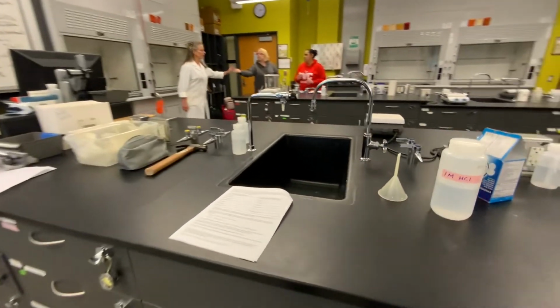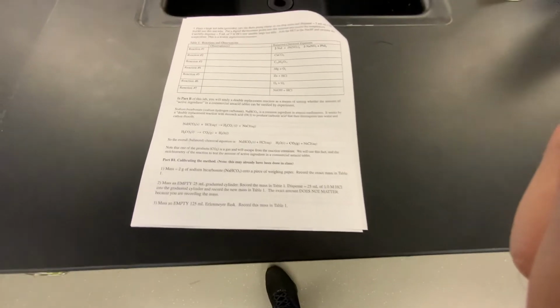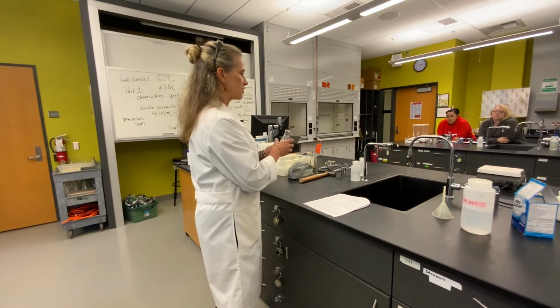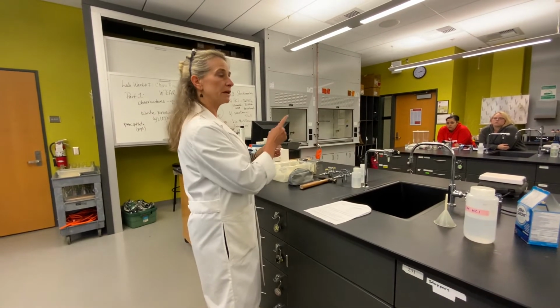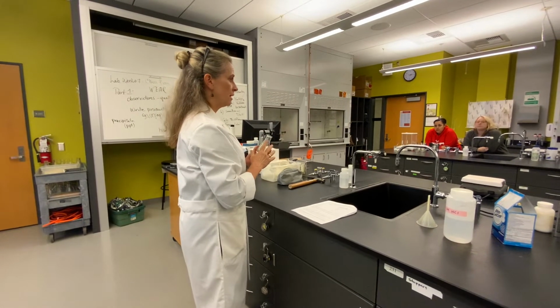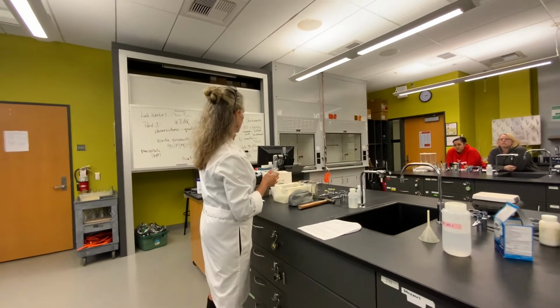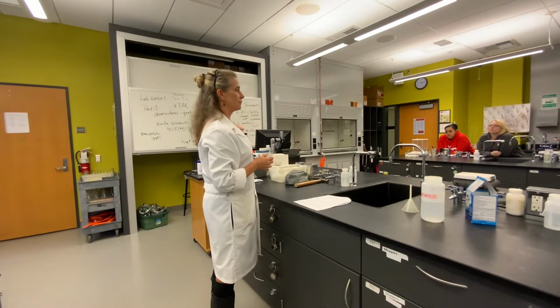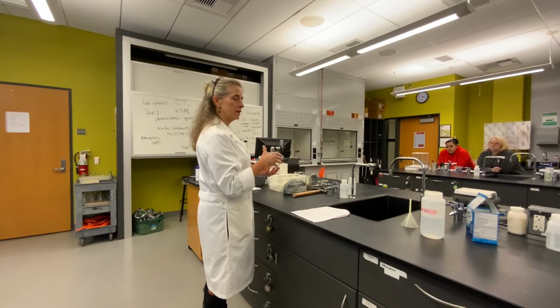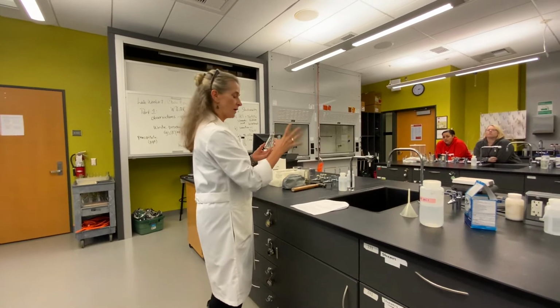This is called an Erlenmeyer flask, okay? And I want to talk a little bit about the shape of this and why it is what it is. When we do this reaction in here, one of the things we want is for the carbon dioxide to escape, right? But we don't want the water to escape, because we're going to figure out how many moles of carbon dioxide went away, and that's going to tell us how many moles of the sodium bicarbonate is in our antacid tablet or in our first reaction. So we don't want to lose water, and the shape of this container helps us keep the water in and let the gas escape. Does that make sense? Okay.